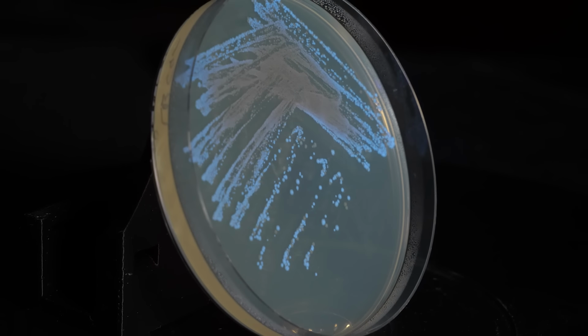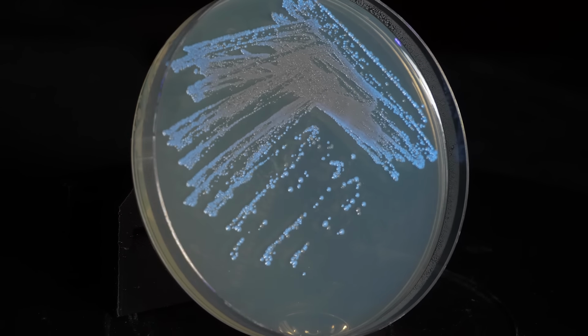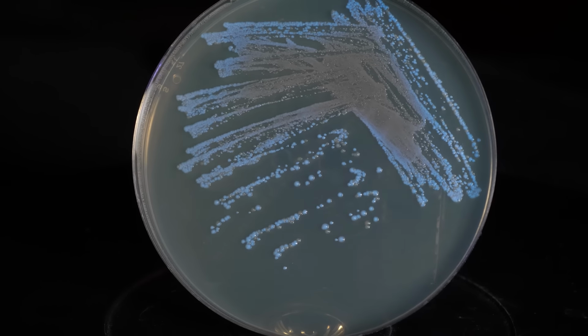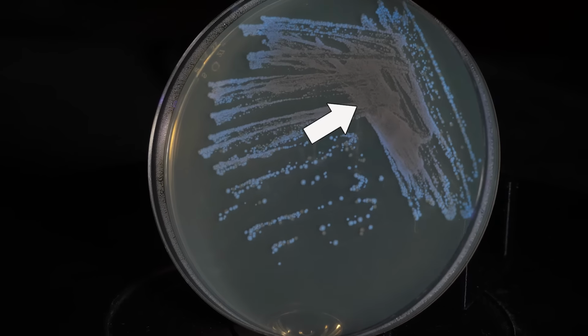In a similar vein, I have one fluorescent protein that behaves like a timer, and over the course of about 24 hours, it shifts its fluorescence from blue to red. Here you can see different cells seem to be glowing different colors, and you can see that the red ones are much older than the blue ones.